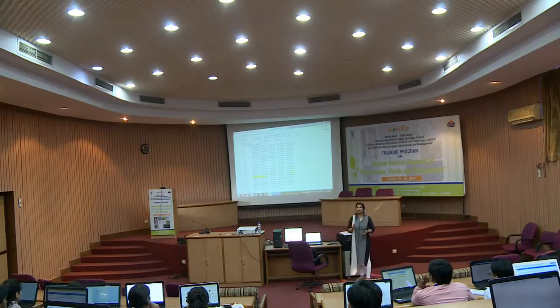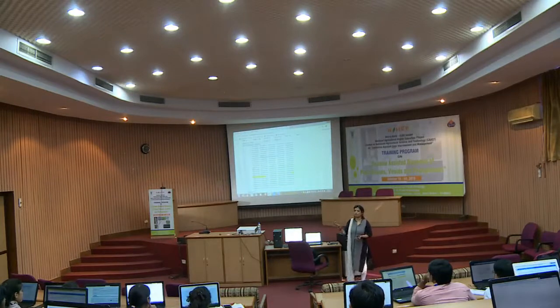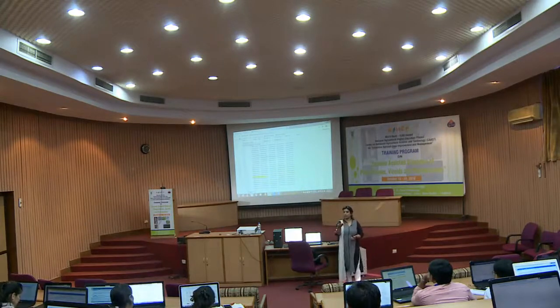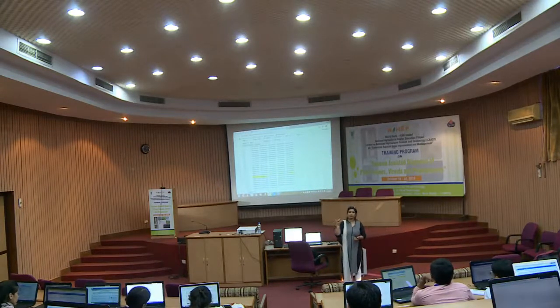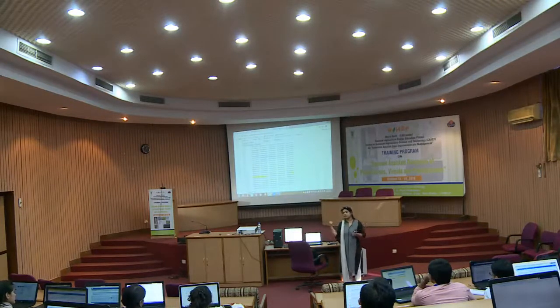So, how many of you have already done some Sanger sequencing? Anybody did? Okay, you all did. Okay, what is the Sanger sequencing then? We'll not go too deep. I'll just tell you that these particular samples which we are generating day to day in our lab, we are sending to the company people that we want the Sanger sequencing of this. So, we want to give them the PCR product, either purified or unpurified. If it is unpurified, then the company people will purify, or if we are sending the purified only, then the company people will sequence it using our primers, whatever we are giving them, right.